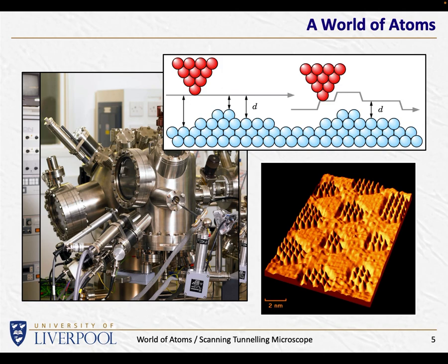And people will study images like this to try and understand, why are the atoms doing that? Why are the atoms, in this case the iron atoms and the oxygen atoms that are making up the rust, why are they arranged in this particular way? It turns out there are two phases of iron oxide in this particular surface, Fe2O3 and Fe3O4, and the atoms have decided to arrange themselves in a particular way.